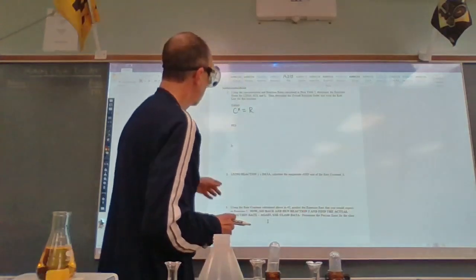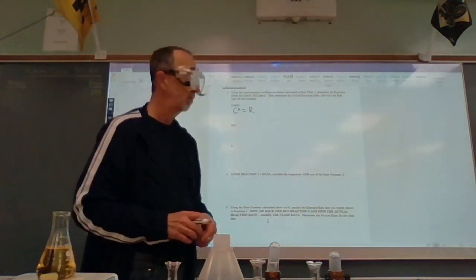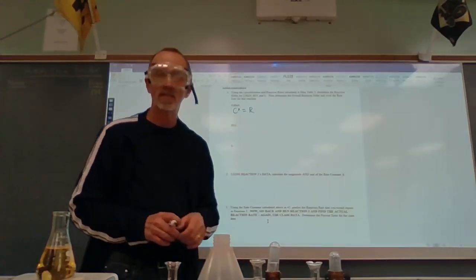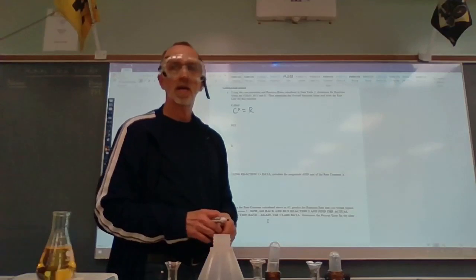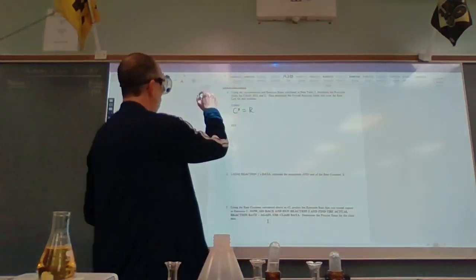So how do you do that? Well, we should know by now, to determine the reaction order for acetone, we have to choose 2 experiments whereby the concentrations of both HCl and I2, we have 3 reactants now, are constant. And if you look back at your data table 2, that happens in experiments 1 and 2.